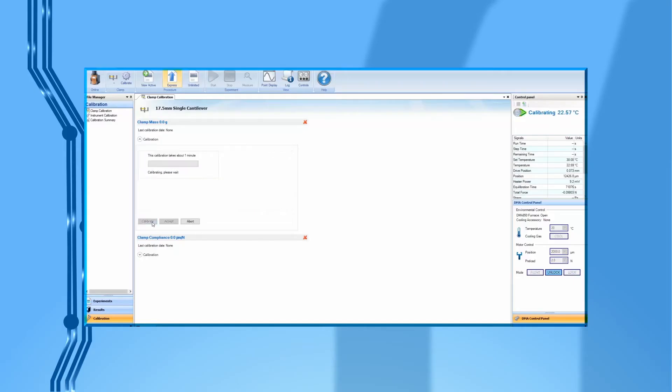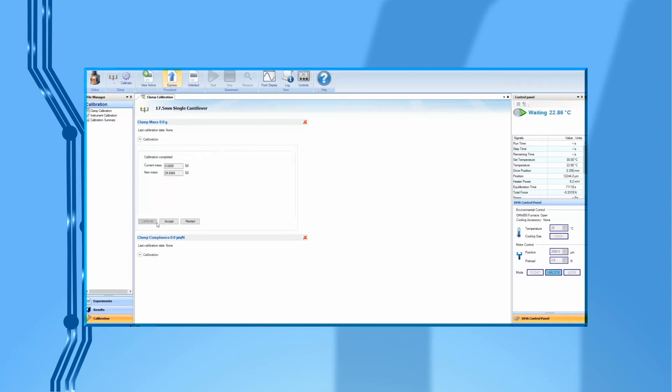From TRIO software, press Calibrate to begin. This calibration is to measure the mass of the movable clamp. After it is finished, click on Accept.